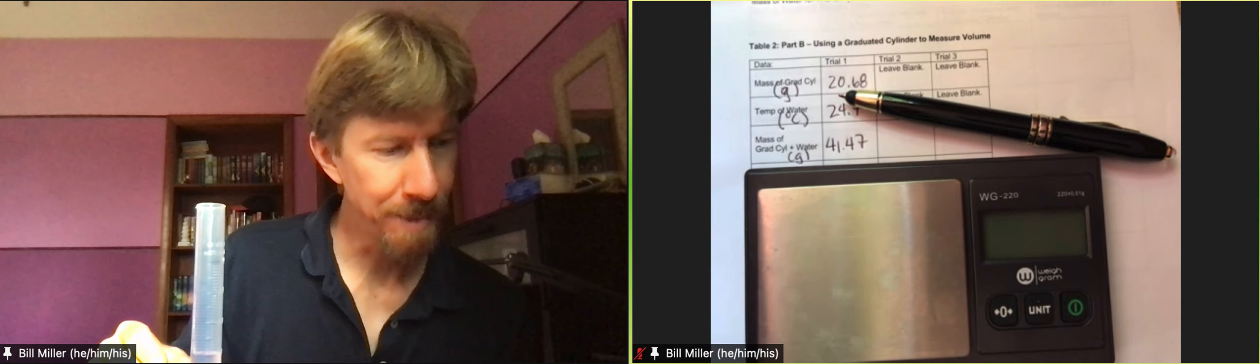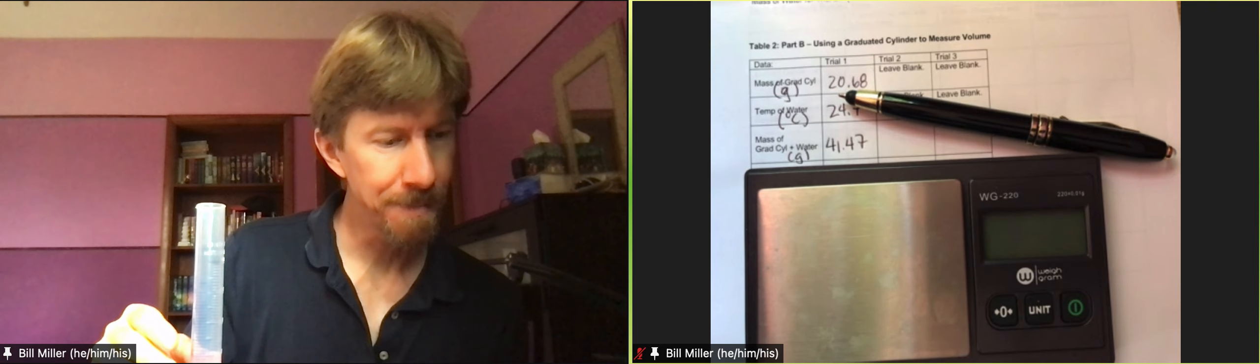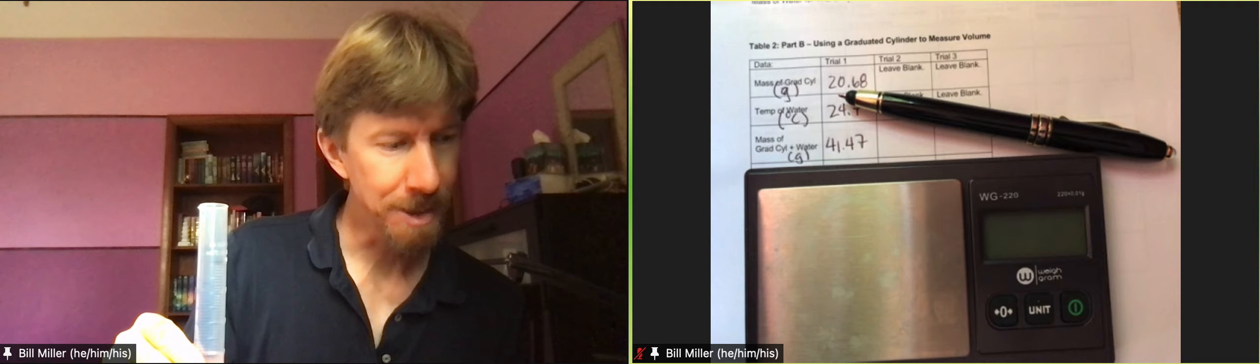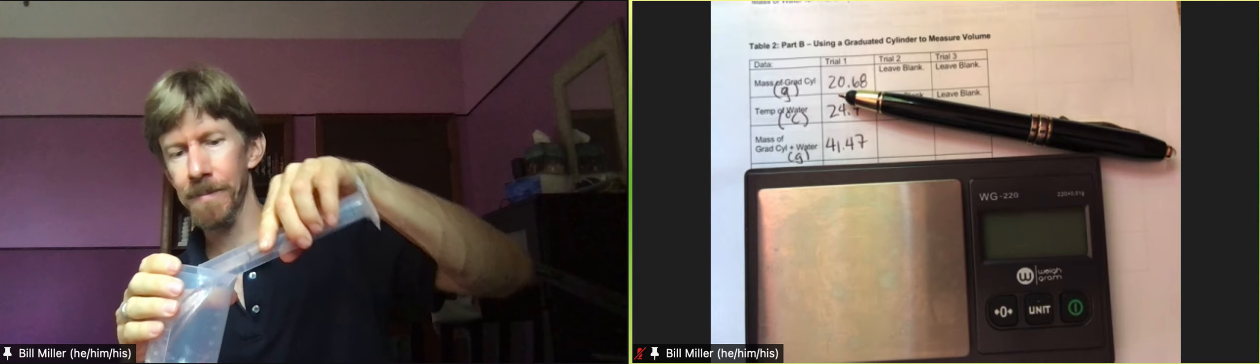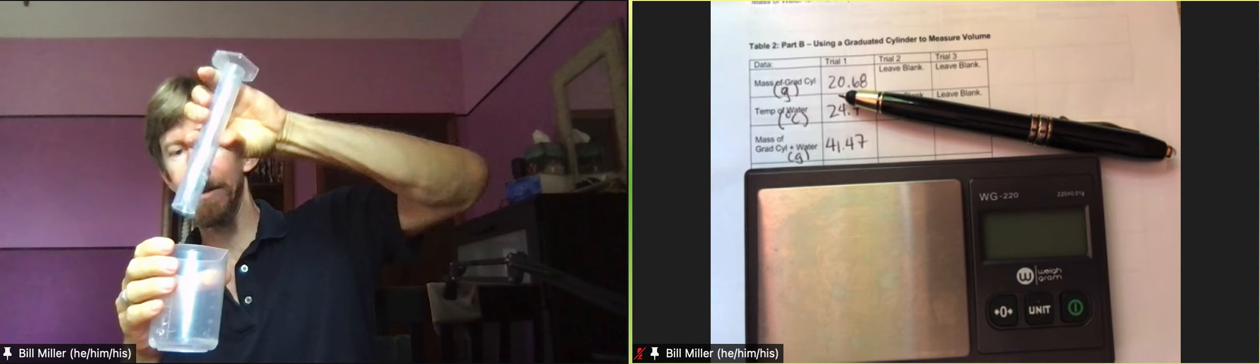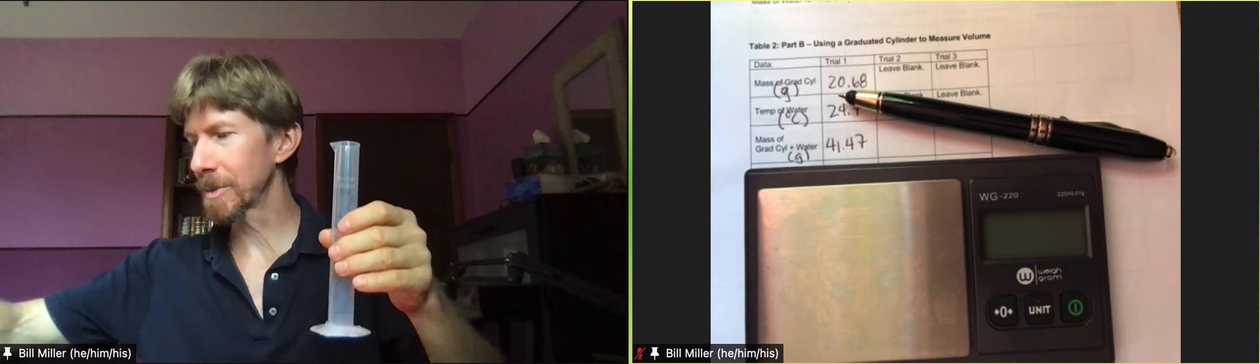Now we get that picture, record the mass of the graduated cylinder with your water in it, empty your graduated cylinder and carefully measure out another 20 milliliters. So I've got my waste beaker here, empty it out. You don't have to dry it out because you're just putting water in it again.